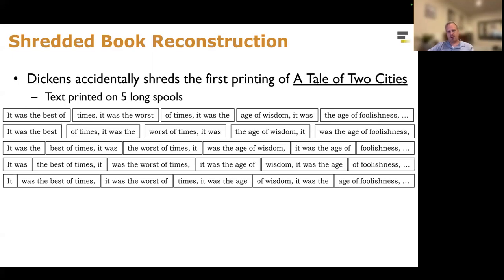Today, with say Illumina short read sequencing, those sequencing reads will be maybe a few hundred nucleotides long. In the case of long read sequencing, those pieces are longer than short reads. They're maybe 10,000 or 100,000 bases long, but still, compared to entire chromosomes, like mammalian chromosomes that are hundreds of millions of bases long, they are still relatively short. There may be 10,000 out of 100 million bases in a given read.